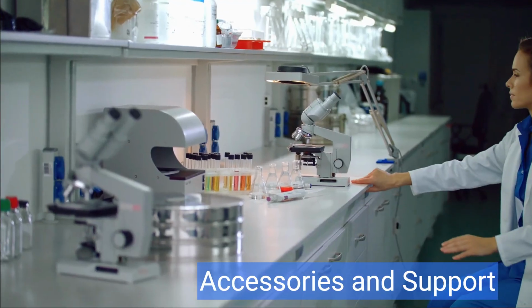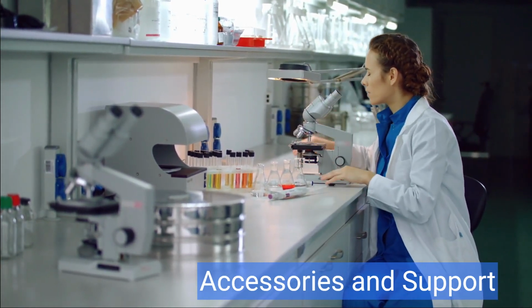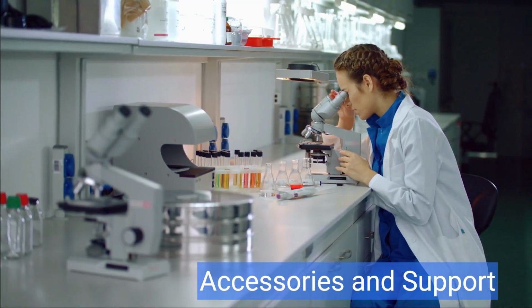Step 10. Accessories and support. Check if the microscope comes with necessary accessories like slides, cover slips, and storage cases. Also, consider the availability of customer support and warranties.